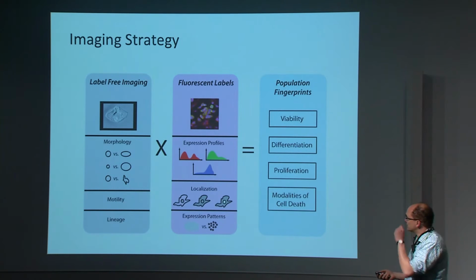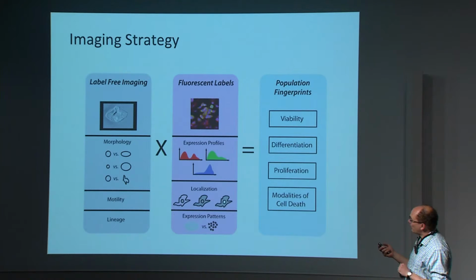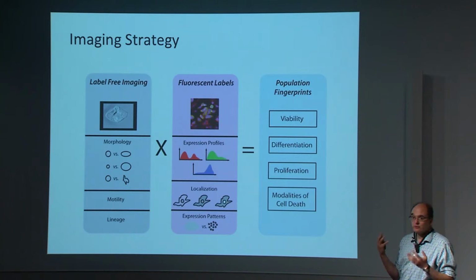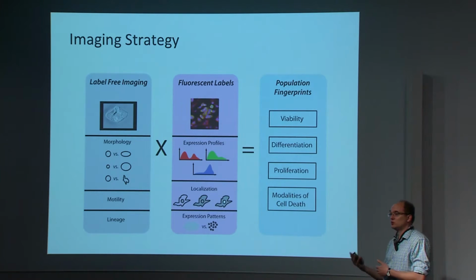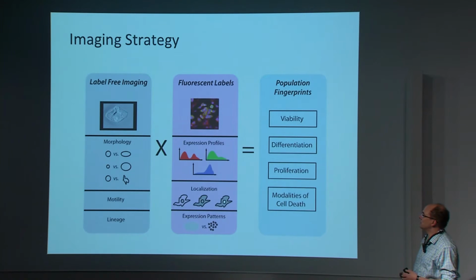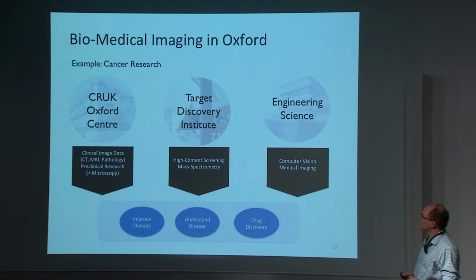The challenge is to develop image analysis or data analytics tools that are heavily automated. They are more automated than what you saw in medical imaging in the past, because with a medical image, if this is one exam, you could always consult a clinician and get some input. Here you really want to avoid this because you want to generate a lot of data points automatically.